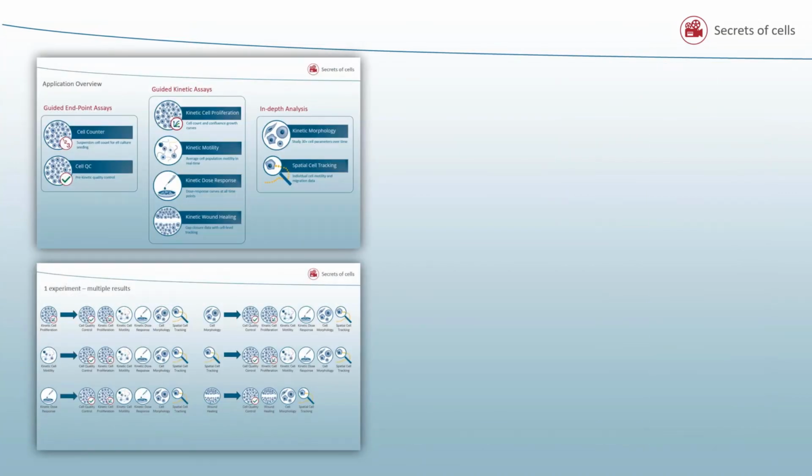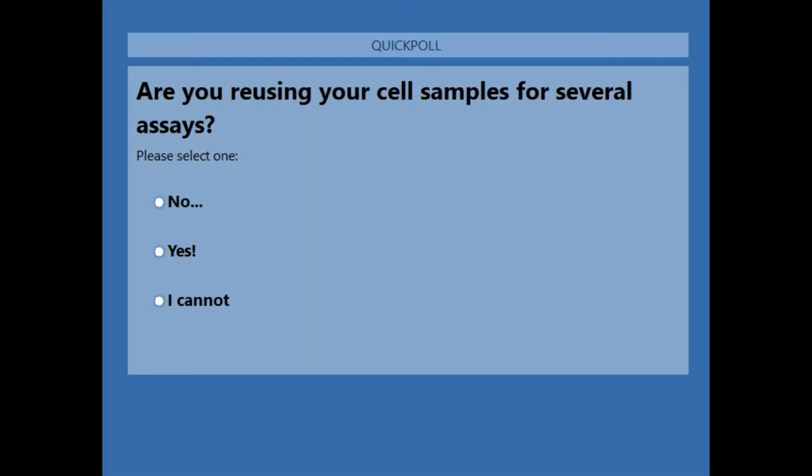Okay, so let's see if you actually would use data reanalysis, or do you use data reanalysis in your daily research? So let's do a quick poll. Are you reusing your cell samples for several assays?